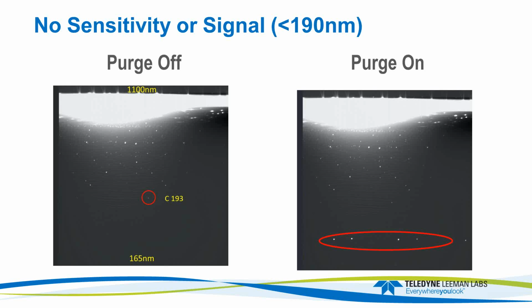So it's a very quick test. You don't need a method. Just do a full frame, take image, go down there, and you should see this. This is on a Prodigy 7. The way these lines lay out on a Prodigy is a little different, but here you can see the two lines in two different optical orders, and actually a third optical order off to the side there. So if you have established purge, you should be able to see these lines.